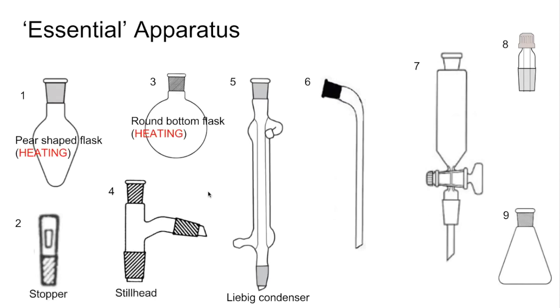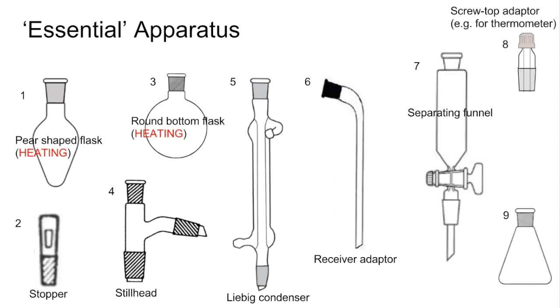Number six is called a receiver adapter, which enables you to collect whatever condenses in the condenser into a suitable collection vessel. Number seven is a separating funnel — I'll come onto that at the end of the video. Number eight is a screw top adapter; for example, you could put a thermometer into it and place it at the top of the still head to measure the temperature of the vapour. Number nine is a conical flask, used to collect substances in — the receiver adapter would go into it and the product could drop in. Remember, you don't use conical flasks for heating.